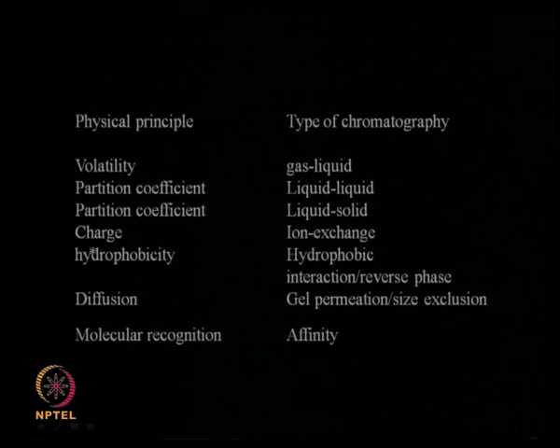So hydrophobic forces are the key in deciding on the separation. If the diffusion of the proteins through pores is the key, then it is called gel permeation chromatography or size exclusion chromatography, GPC. If the molecular recognition or a binding between a ligand and protein is what is important, then it is called the affinity chromatography.